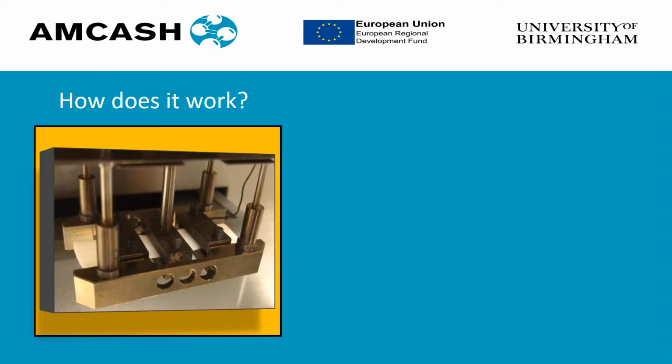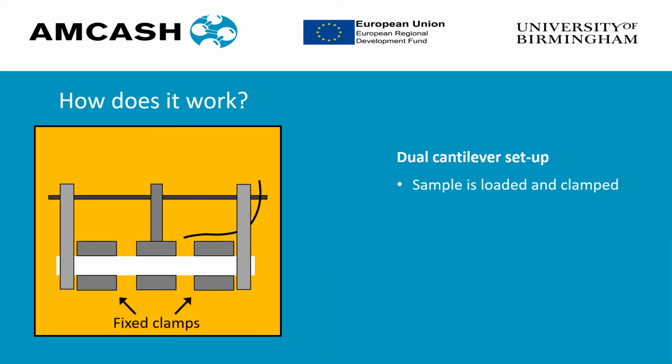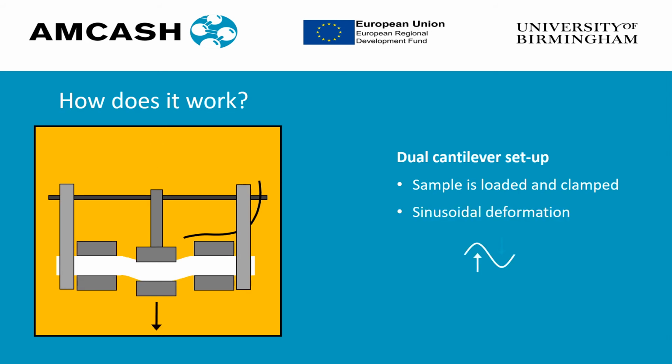The image shows a sample setup for a dual cantilever testing run. This is where a sample is loaded into the frame and secured at either end in two fixed clamps. It is also secured in the centre in a clamp which moves up and down during the run. This applies force cyclically in what is known as sinusoidal deformation.